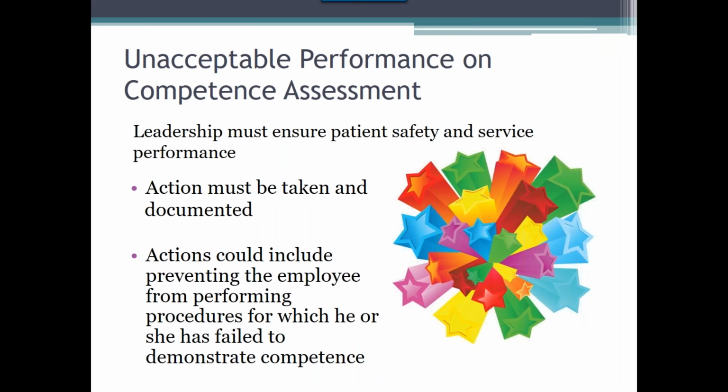A key component of an effective competency program are the steps taken when competency has not been met. What do you do when you competency a staff member and it's evident that they cannot perform the process or they miss critical steps in the process? It's important to have good documentation when an employee has failed to demonstrate competency. What did you do to re-educate the employee? Did you request that they read policies and procedures to freshen up on the content? Did you have them shadow another employee on the process? Did you give them material to review?